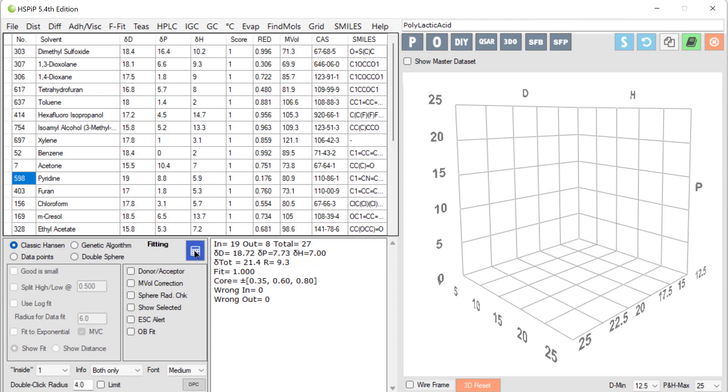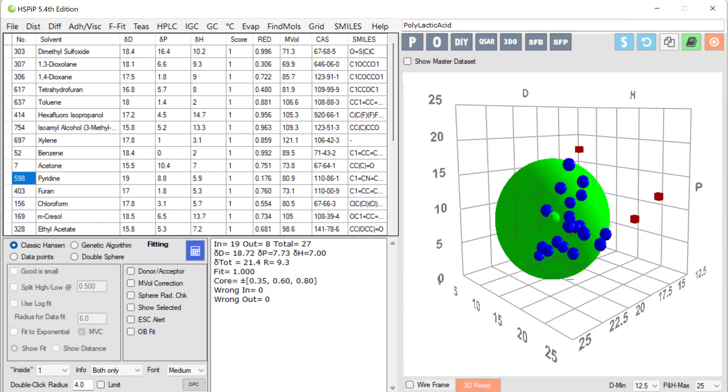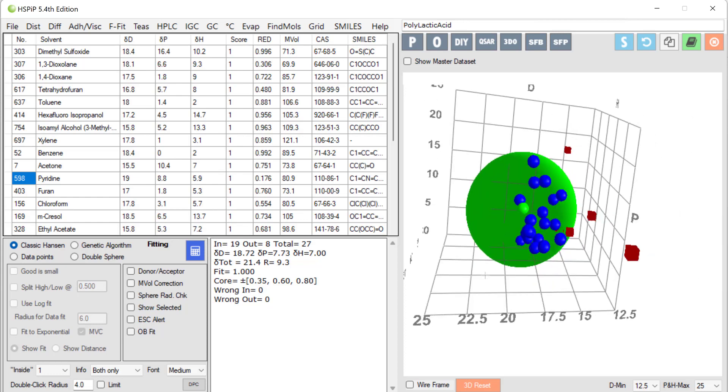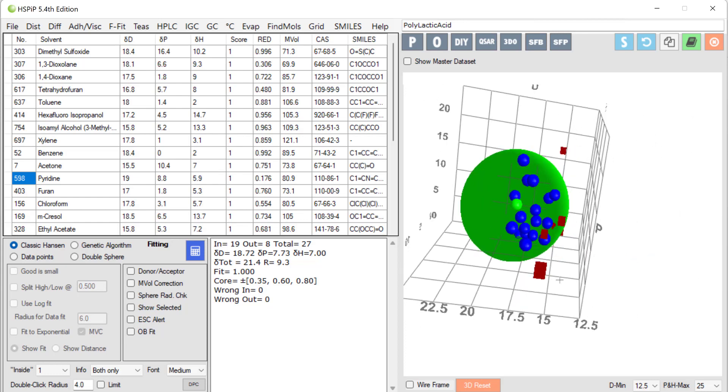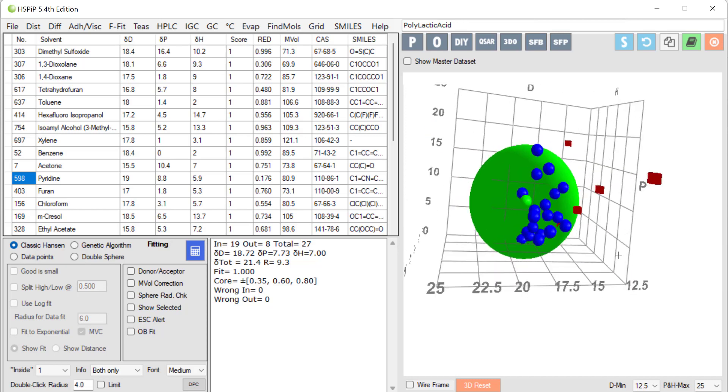We then fit these data, clicking the button, and we get this sphere. The center of the sphere is the HSP of, in this case polylactic acid, 18.7, 7.7, 7.0. And all the good solvents are inside, the ones in blue, and all the bad solvents in red are on the outside.